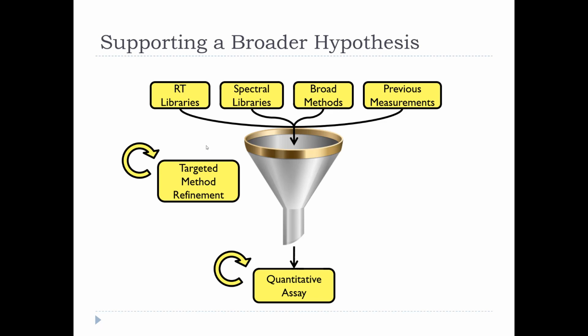And I think it comes from our background in, the whole goal of Skyline originally was to end up with a truly quantitative assay. And we were commissioned to do Skyline originally by a clinical proteomics consortium. And so this idea of how do you get to something truly quantitative that could actually be used in the clinic was a major focus for us.